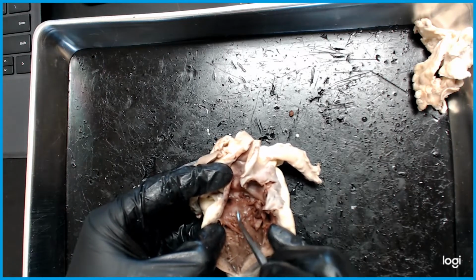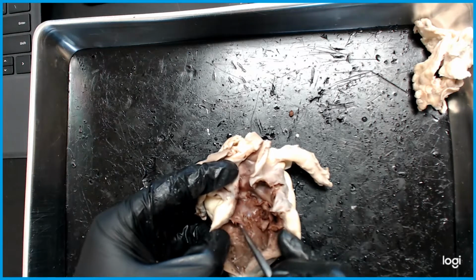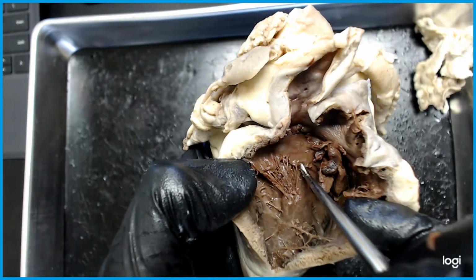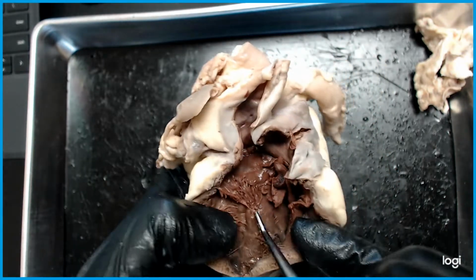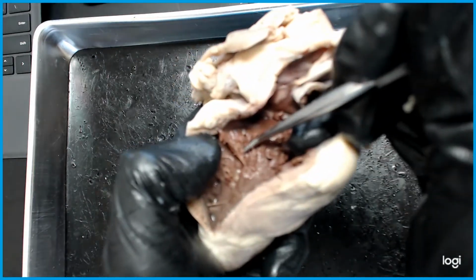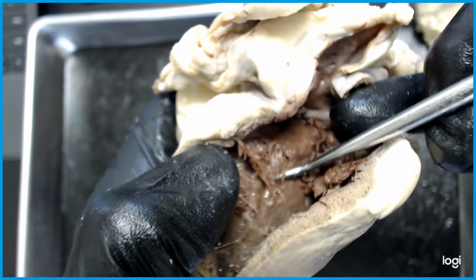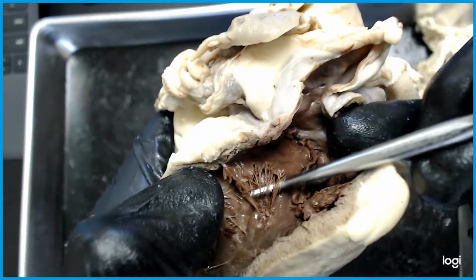This is the valve. And if I grab my probe, I should be able to see the flaps or move the flaps. Let's see if I can get this closer. Right there. That's the tricuspid. Okay. So in the next section, the tricuspid valve flaps are held by the chordae tendineae. So let's see if we can get a good focus view. Let's get it closer. There we go. These right here are the chordae tendineae. Remember, the tendons are attached to muscles. So there you have it.